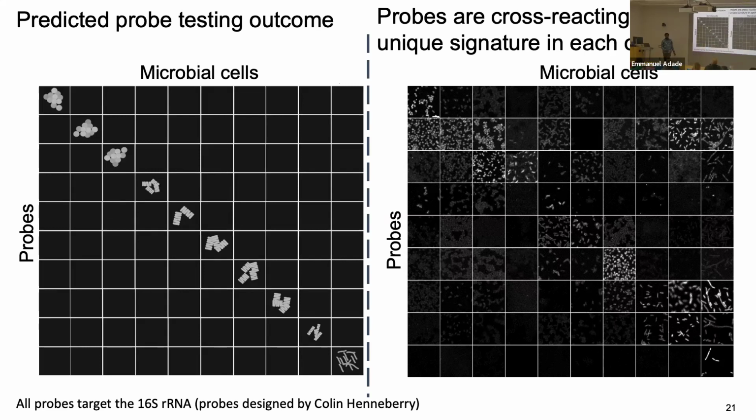So if we can regenerate this ID, it's a fingerprint of cross-reacting probes and target probes within each cell, that can become an ID that we can use to identify each of these cells within the matrix and say, this can be classified as cell A and cell B. So that was what we thought about. And we're like, okay, we'll see what we'll do with this.